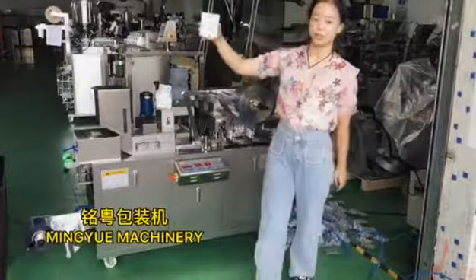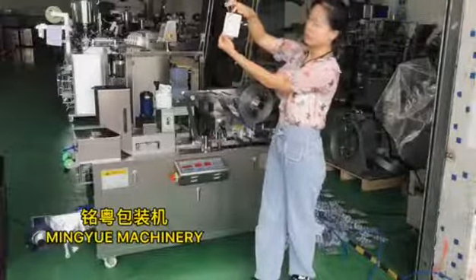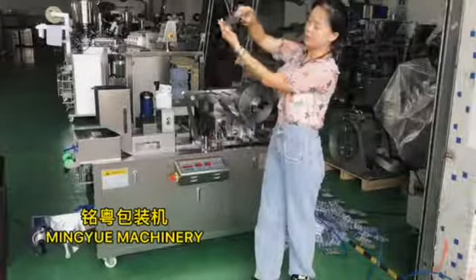You can see this is all really suitable. Really perfect. This is the back side. We put the capsule, or candy, or tablet, in PVC form.